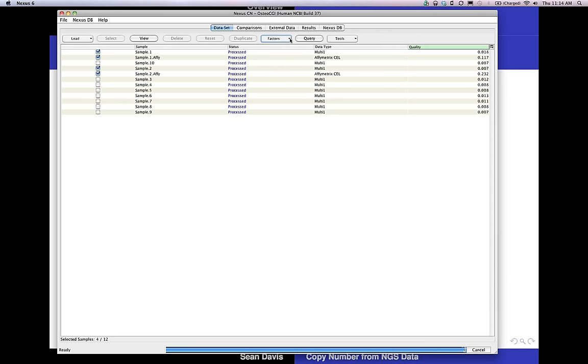And since we're talking about sequencing data, one of the factors that we could add is actually single nucleotide variation. So as an example, using the P16 CDKN2A example, there are a couple of ways to inactivate P16. The most likely, or the most common, is deletion, but you could actually introduce a mutation that's inactivating, or a small insertion or deletion that doesn't necessarily show up as a copy number change.